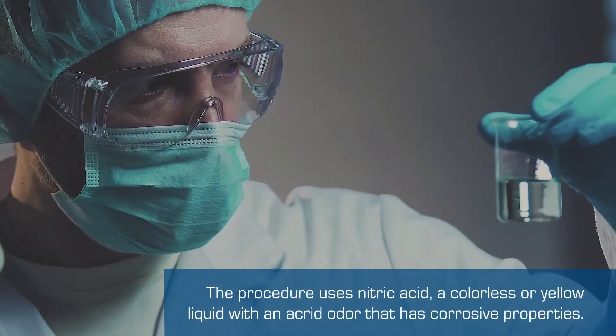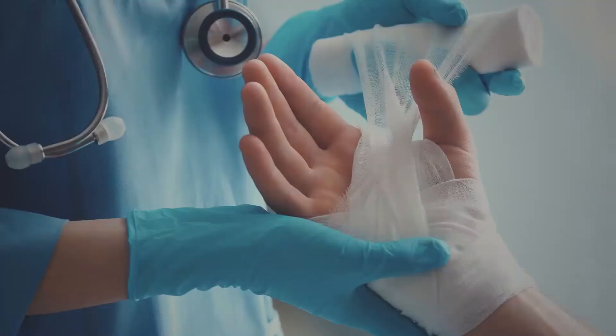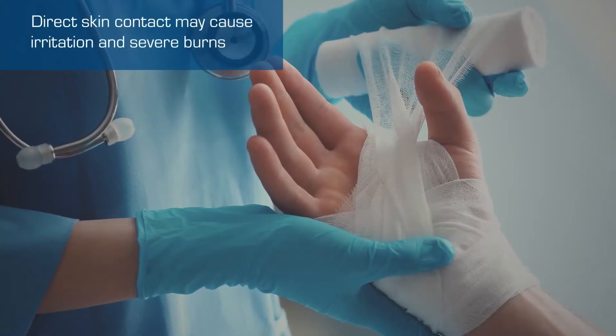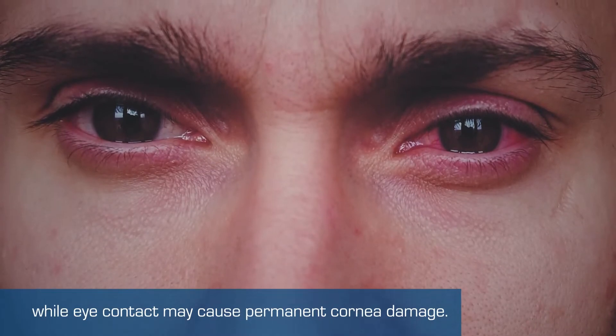The procedure uses nitric acid, a colorless or yellow liquid with an acrid odor that has corrosive properties. Direct skin contact may cause irritation and severe burns, while eye contact may cause permanent cornea damage.